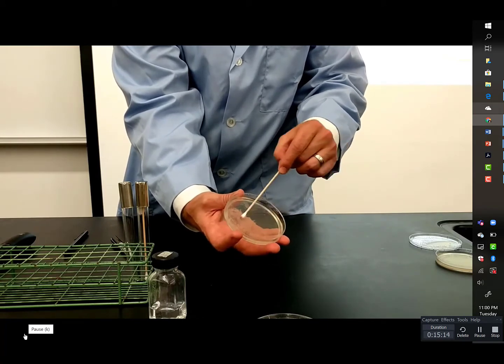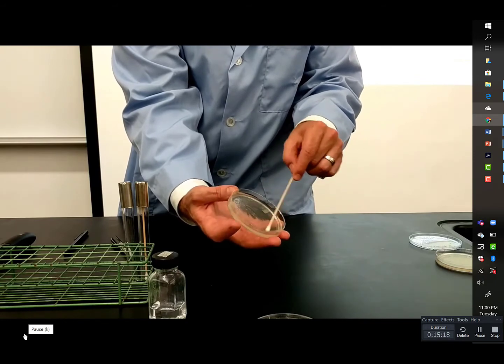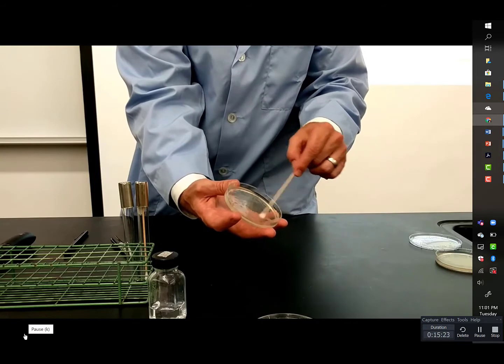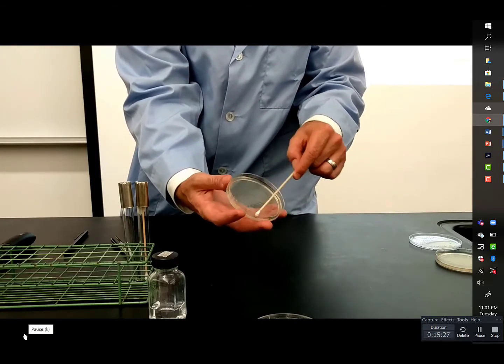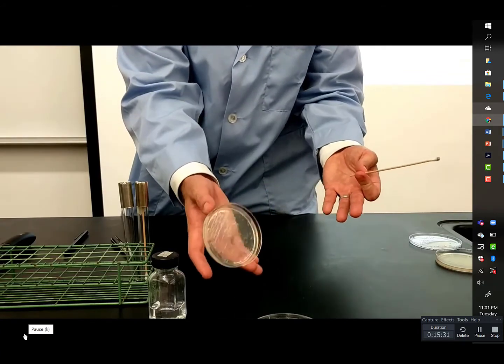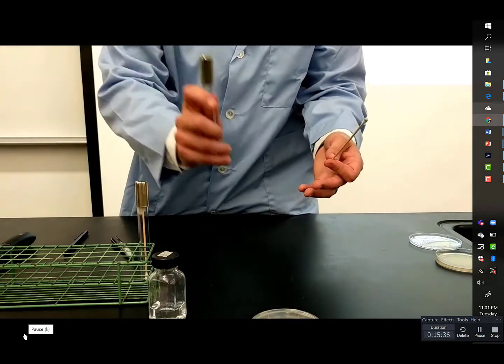Notice how I'm keeping my fingers away from the sides. The way that this experiment is being conducted is to avoid getting anything else into the experiment, right? I'm just trying to test the bottom of my shoe, not bacteria from my hands. So I'm being very careful to handle the edges without getting bacteria from my hands into the sample.